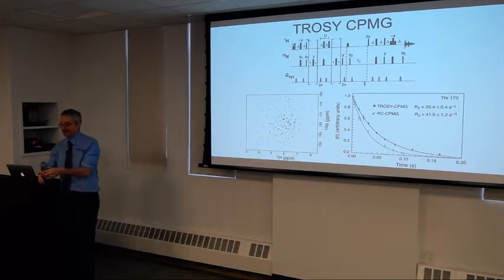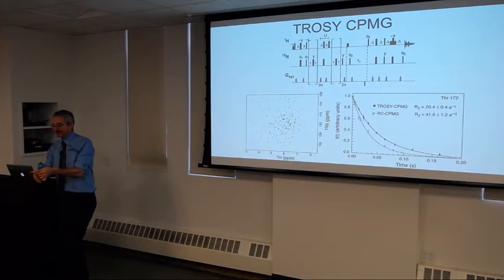And now what's the trick? If the two operators spend time parallel to each other, then we want, in some sense, to make them anti-parallel to each other for some time. And I said that spins aren't very smart. We can trick them into thinking they're evolving relative to each other if we periodically invert them relative to each other.